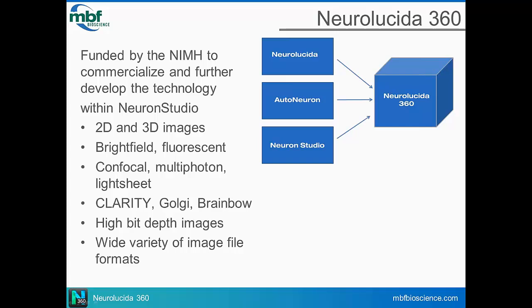Golgi impregnation is an area of active research for us. I'll tell you a little bit more about it, where we're at, and what makes it sort of a special case scenario. But likewise, Brainbow has additional and interesting challenges.